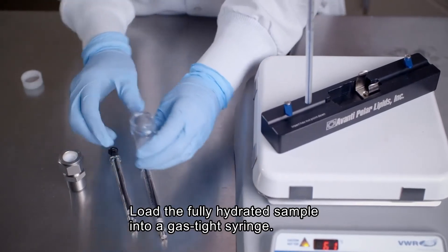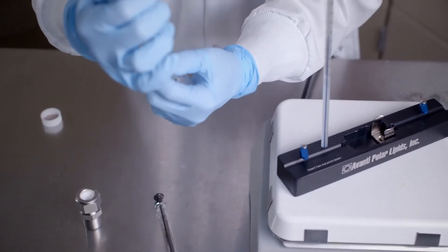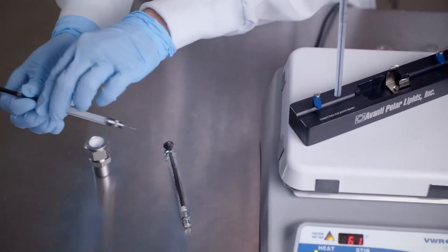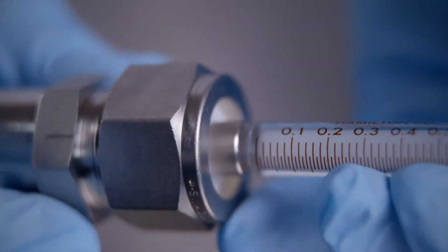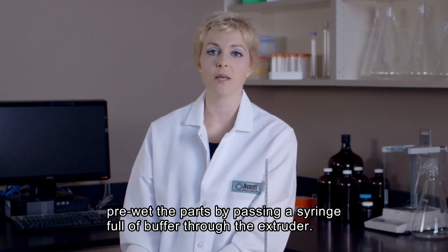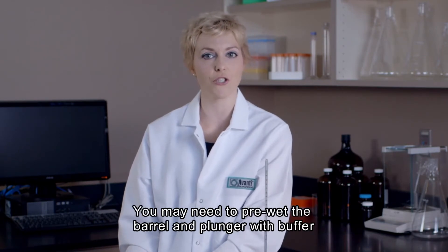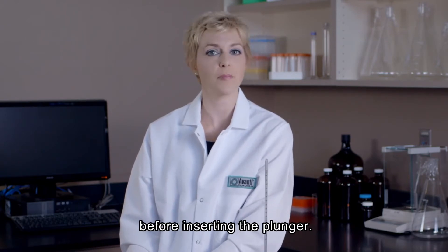Once the sample is fully hydrated, we will load it into one of our gas-tight syringes. As a quick tip, in order to reduce the dead volume, pre-wet the extruder parts by passing a syringe full of buffer through the extruder and then discarding the buffer. Additionally, new syringes may have tight-fitting parts, so to facilitate extrusion, it may be necessary to pre-wet the barrel and plunger with buffer prior to inserting the plunger into the barrel.